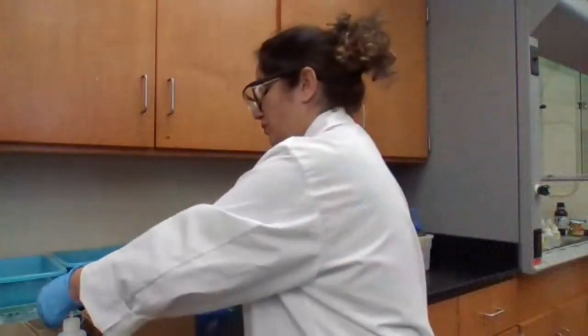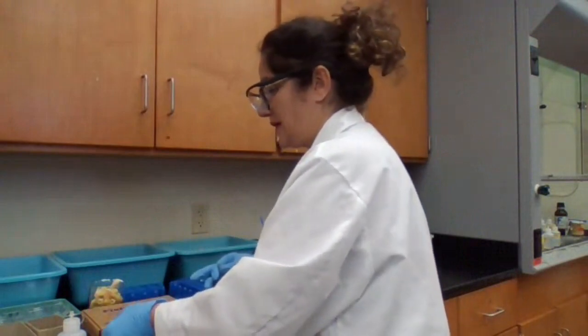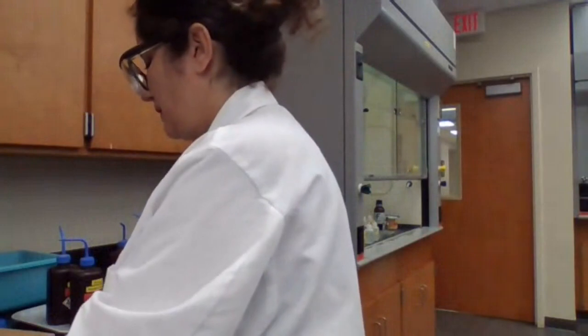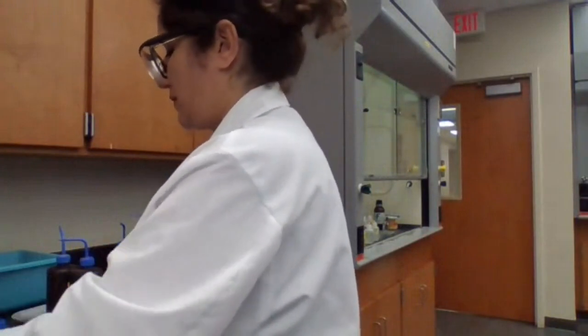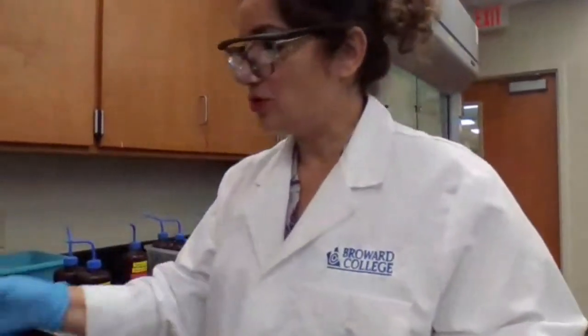Base for blue, remember? I'm leaving this out so I can use it later. I'm adding 15 molar ammonium hydroxide until it is basic, and to find out, I'm going to mix it, take a drop with a dropper and add it to the litmus paper.